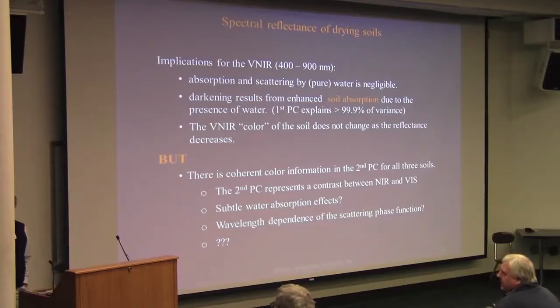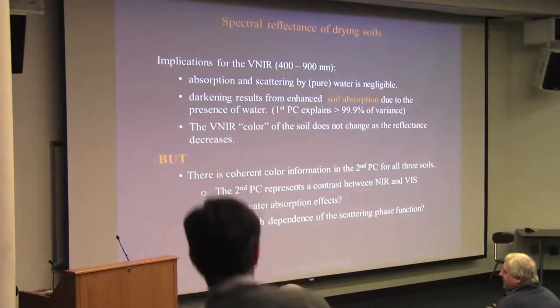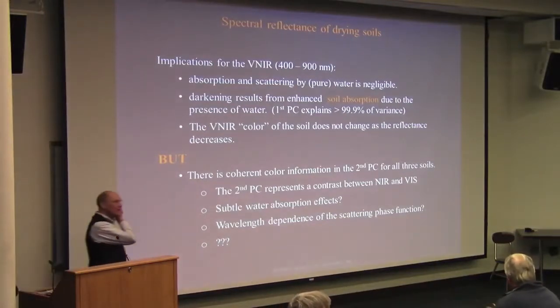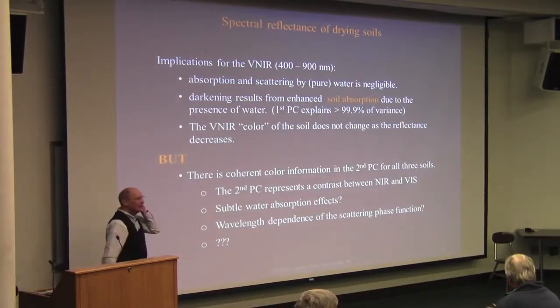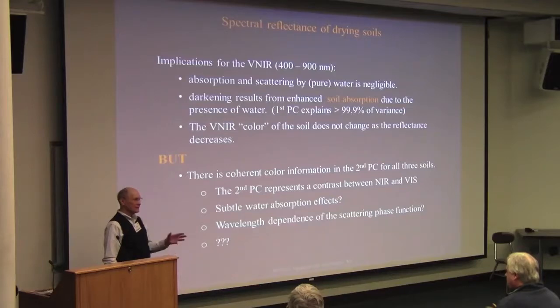Okay. Do we have time for one more? Yeah. Two points. Some of these subtle water absorption effects that you were hitting on across all the different samples that you had could be explained by the clay content or the fines content. Did you look at that? For the Ithaca soil, that's true. For the others, the quartz and the masonry sand, there was very little clay. There was very little organic material.